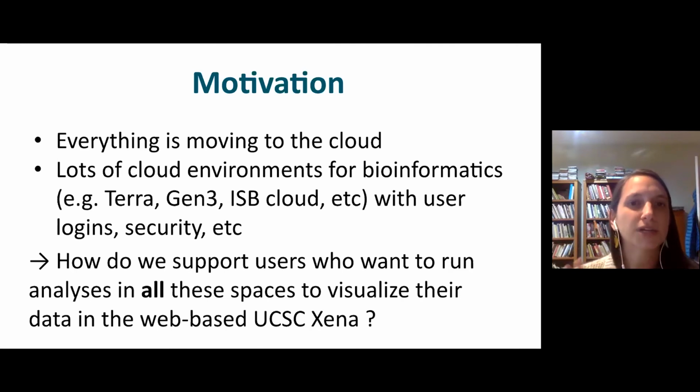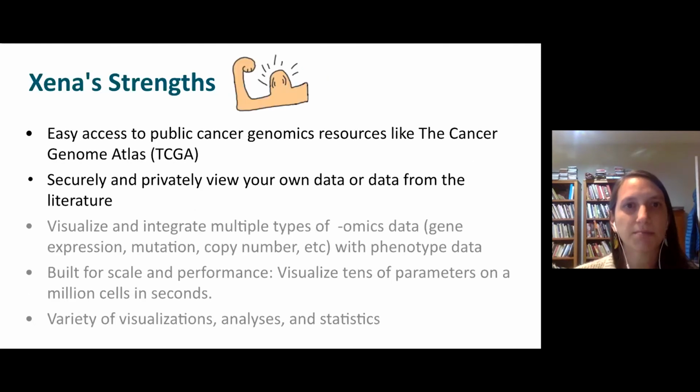And so we were looking at this and we wanted to be able to support users who want to run their analyses in all of these different spaces, not just one, and to visualize that data in the web-based browser that we have. So going back, if you remember, I said that we provide visualization analyses on both public cancer genomics resources and then also on private data. And I just kind of glossed over how we do that. I'm going to give you a peek under the hood now.